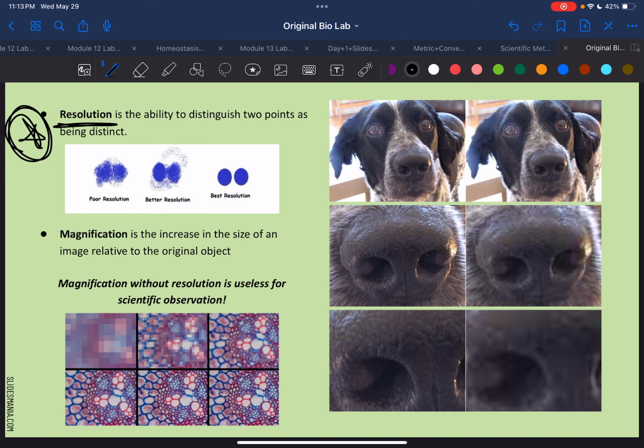So it's kind of like when you take a look at a picture, right? If I'm going to a Taylor Swift concert, and I told you I'm going to a Taylor Swift concert, but all I have is a blurry picture of Taylor Swift, you're not going to know that I actually went there, right? The resolution of your camera, the clearer it is, the higher the resolution.